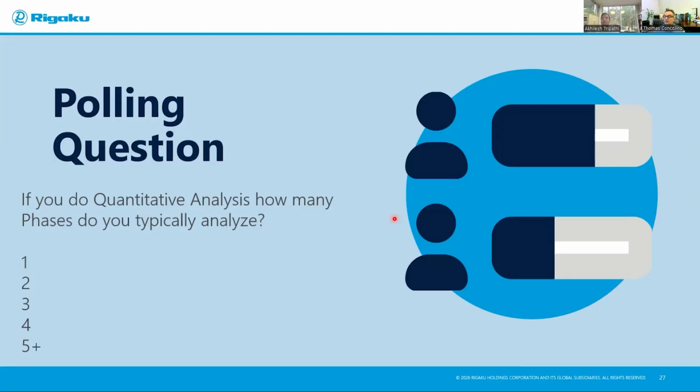Tom, we have a polling question now. We do. But actually, we've had some good questions come in, Akila. So I wanted to get a couple of these out of the way now. So the first one here is actually, we have two of them from the same attendee, and they're actually excellent. So one is, can you use the Rietveld method with the constant area illumination, i.e., variable slits? And so, can you do those measurements, or does Rietveld allow for the refinement of those data points?